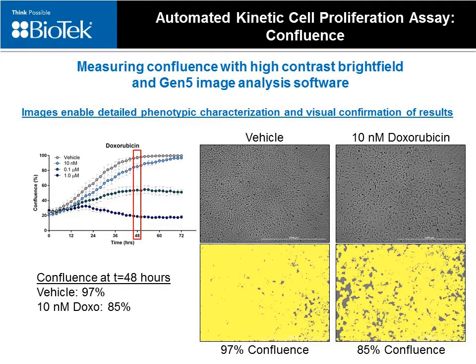However, when we review the corresponding images shown for these conditions at this time point, we observe that there appears to be much more to the story. Although there's an inhibitory effect caused by the doxorubicin treatment that is clearly detected by the differences in confluency, closer inspection shows that there appears to be considerably fewer cells present after 48 hours in the treatment condition than the confluence values might indicate. So with the doxorubicin treatment, cells appear larger and more spread out compared to the negative control.